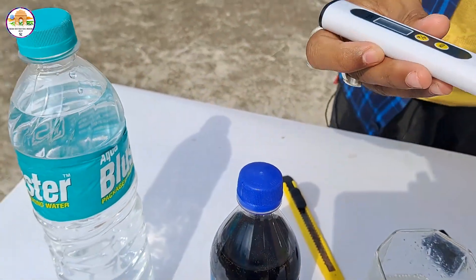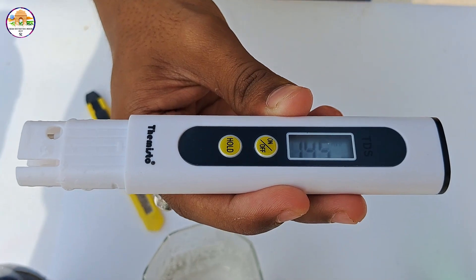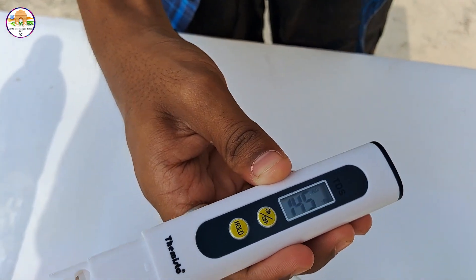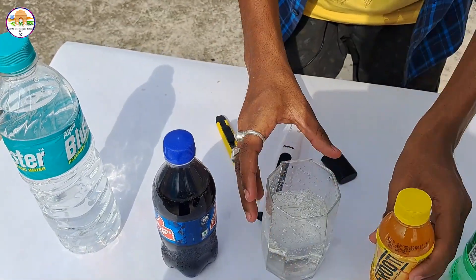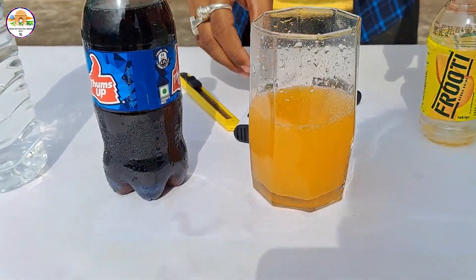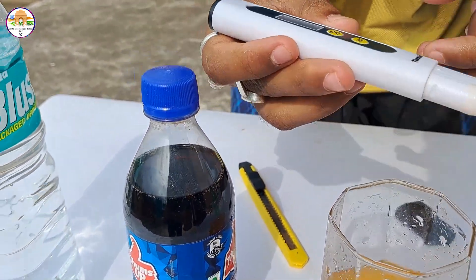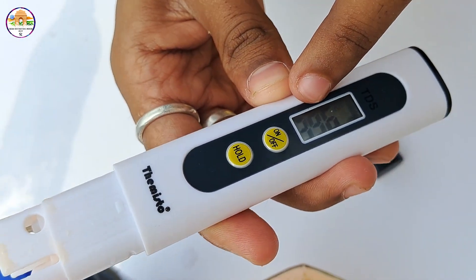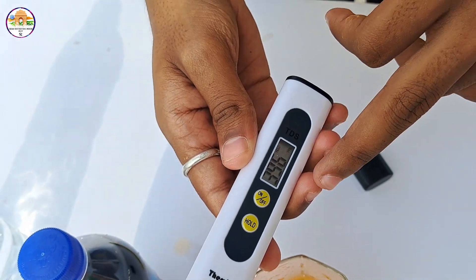We will now test the Sprite. How did you get the Fanta TDS? The Fanta TDS level is 396. The first TDS level is about 130, but the Fanta one is 396.